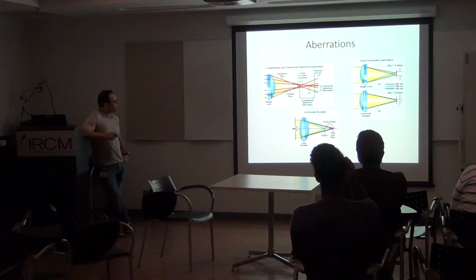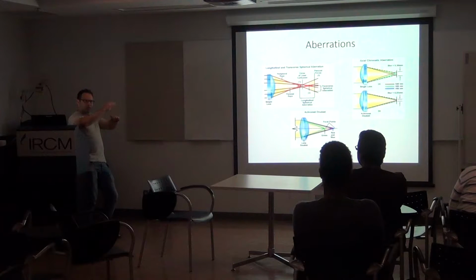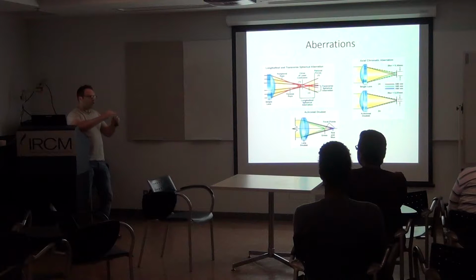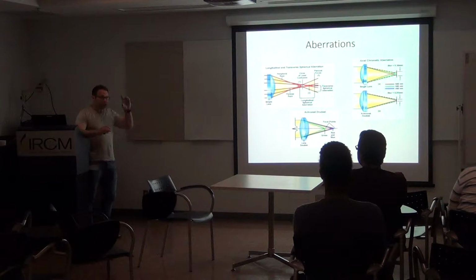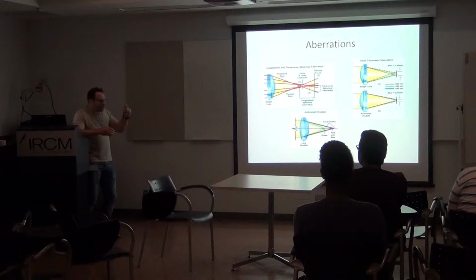Aberration. Those things are important enough, and this is another reason why when you have a digital camera, you can play around with the lens and make different magnification by sliding the lens, and then you see something in more detail, and so on. And if you get a really nice picture, at some point you might see some aberration.